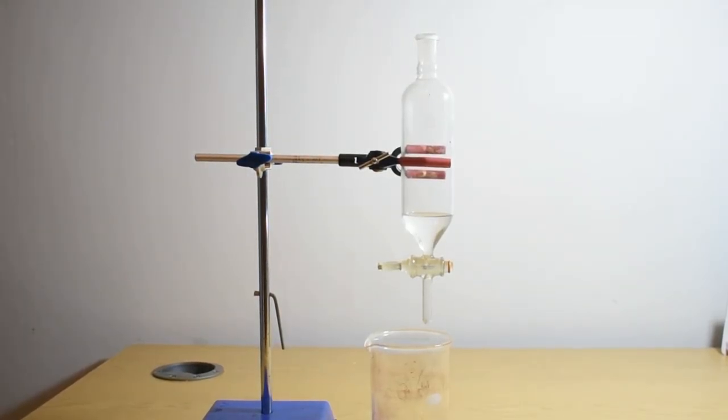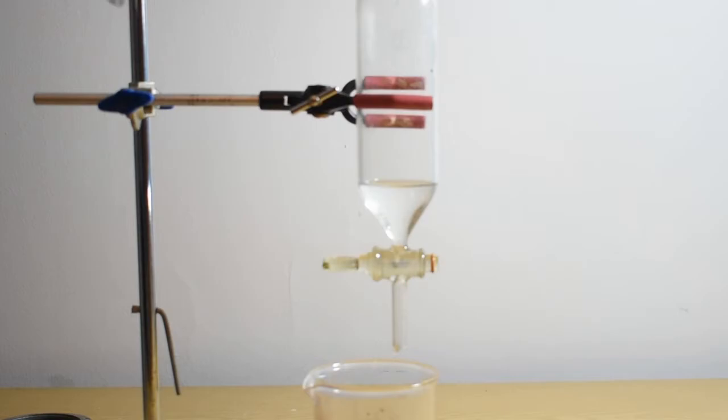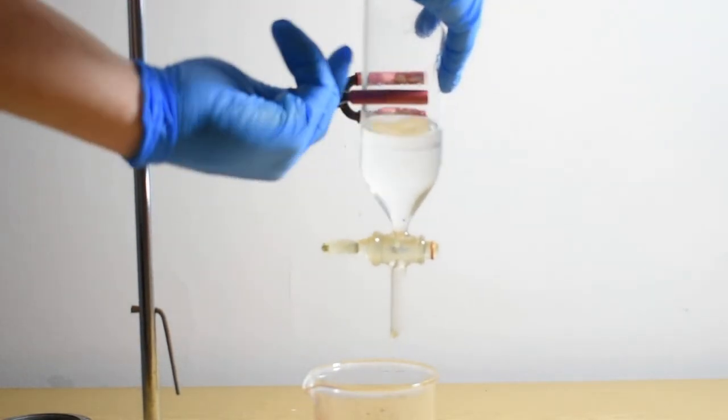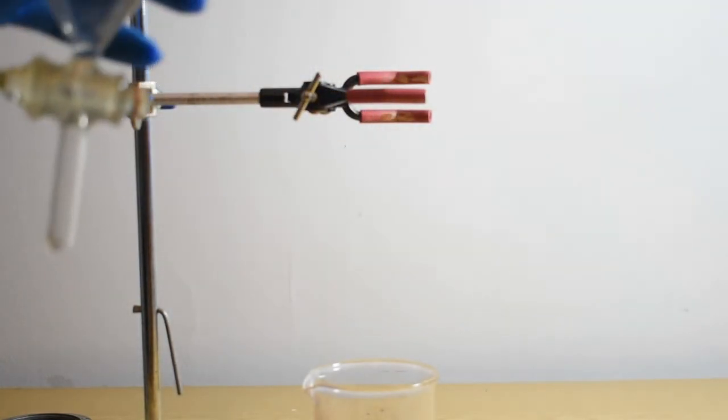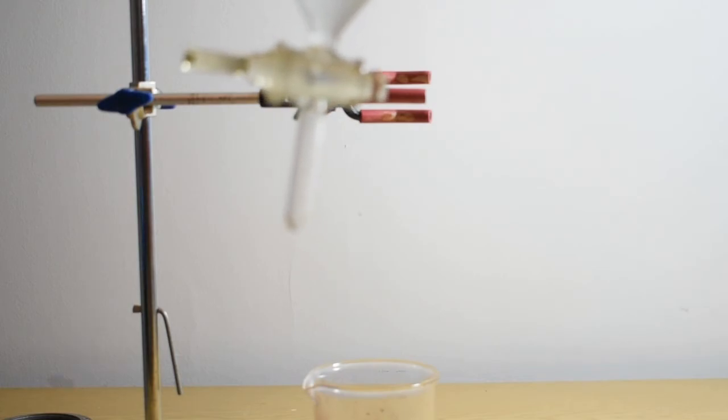Now that the distillate is in a separatory funnel I can begin the washing steps. First I add 50 milliliters of saturated sodium carbonate solution. This should react with any acids, either ethanoic or sulfuric, which distilled over with the distillate. The fizzing is the carbonates reacting with the acids releasing carbon dioxide.